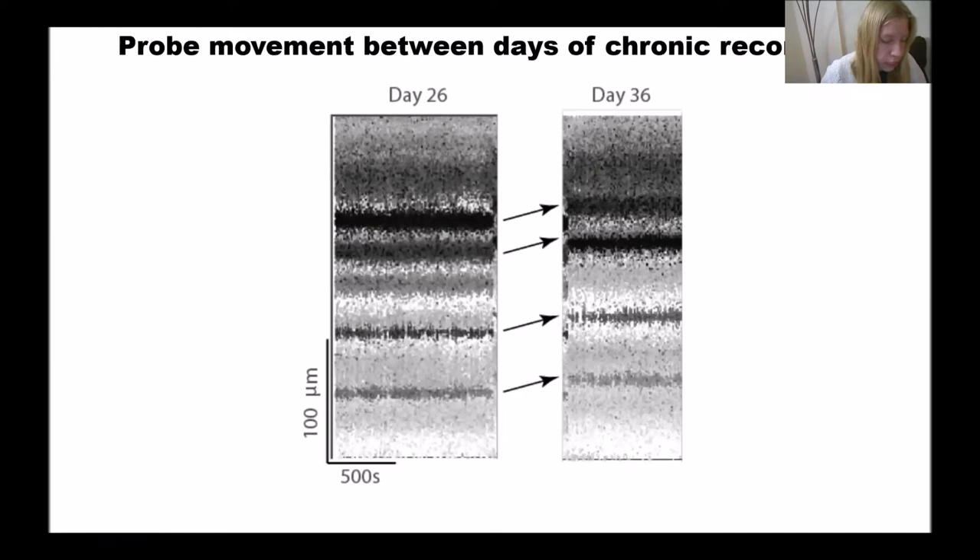We observed that the spiking activity across different days appears to represent the same pattern, but it is shifted in depth. Each dot means a spike: x-axis is time and y-axis is depth. You can appreciate that the lines are similar but shifted upwards from one day to another. In order to combat this, Mari Spahitariu modified the Kilosort algorithm to track and correct for this movement.